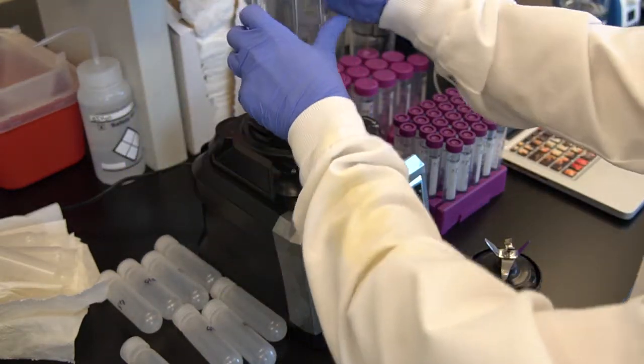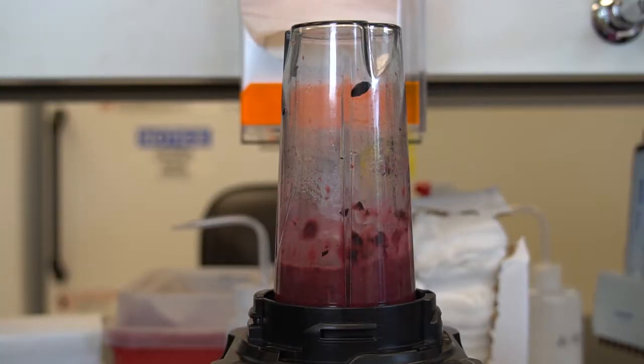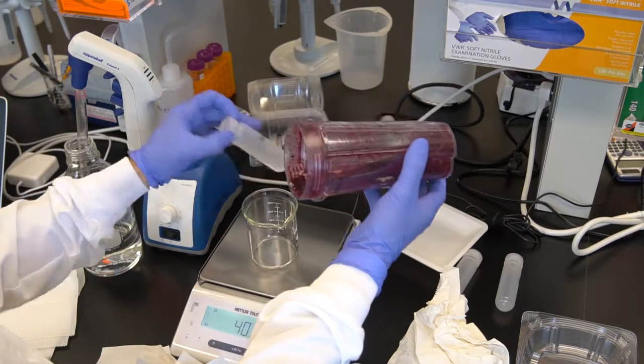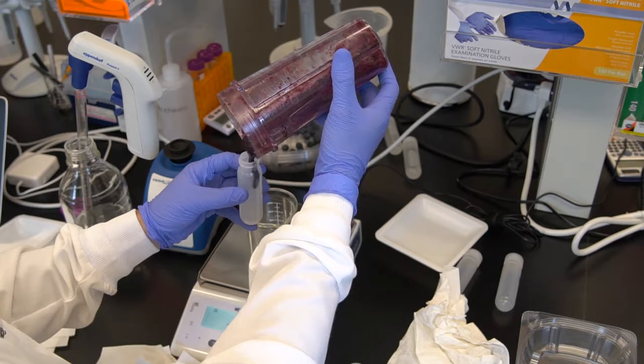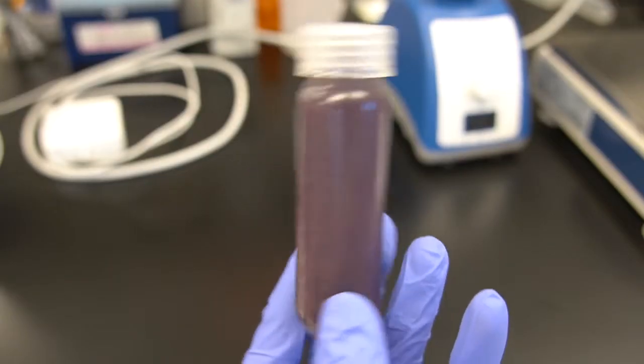First, berries need to be made into a purified juice sample to analyze any kind of chemical traits. After reaching room temperature, a randomized sample of fresh berries is homogenized using this small blender. Not all blueberries ripen at the same time on a given bush, so it's very important to take a representative sample from several different containers when doing chemical trait analysis. Here's what the blended sample looks like.